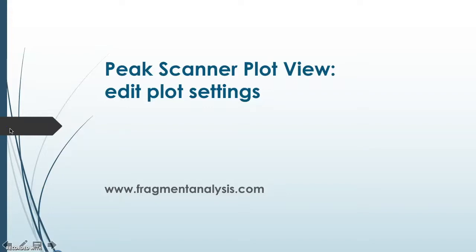This tutorial is for editing plot settings for Plot View. Plot View is important for you to review your data quickly. You can make, update and save personal settings for Plot View.